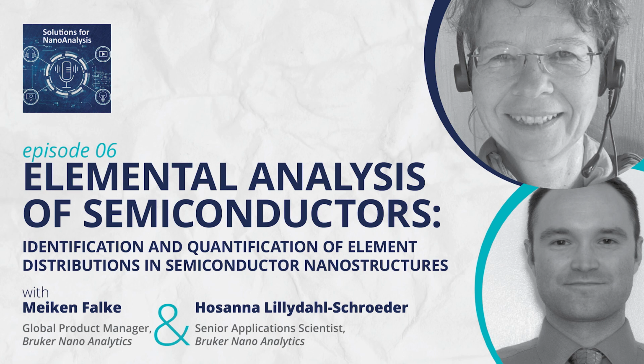and more easy combination of techniques, as I mentioned. Use the good of both sides, EELS and EDS, maybe cathodoluminescence for III-V semiconductors, or combine EDS and diffraction techniques, like, for instance, also orientation mapping, EBSD and orientation mapping in transmission, like TKD, which Bruker also offers, and look on where grain boundaries are, where the diffusion pathways are in a device.